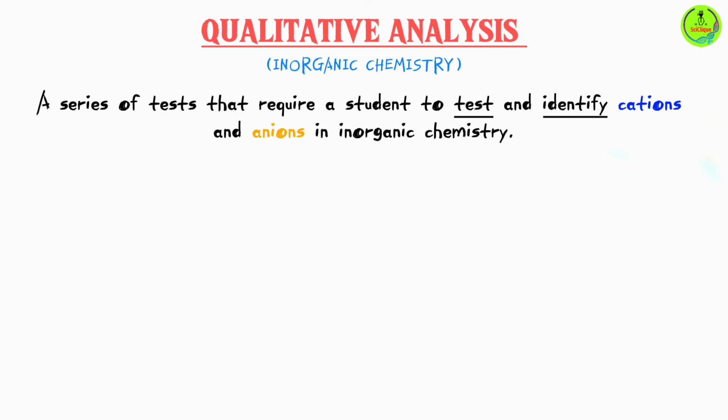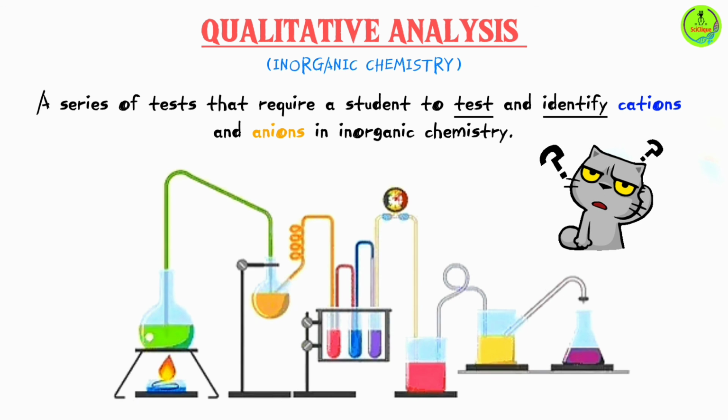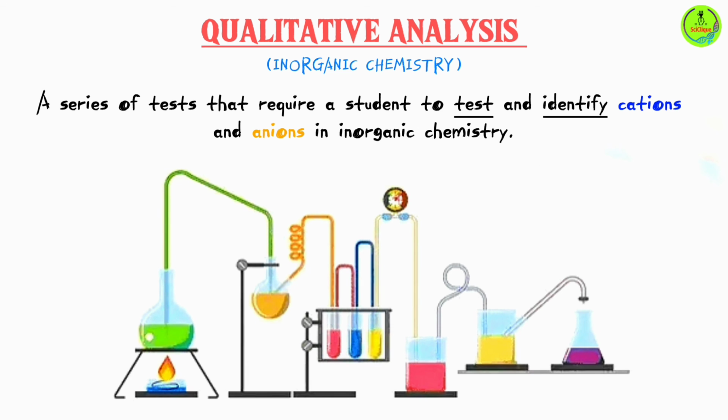Last one. When doing your practicals, work systematically in the order provided, writing down your observations and inferences as you go along. However, if you are unable to make sense of a particular reaction, like you are getting this observation but you can't make out what the inference is supposed to be, leave it. Record your observation and just leave it. Move on to the next test. Don't waste your time. At the end, you should make time to go over your work, correct any mistakes, and check for anything you have missed.